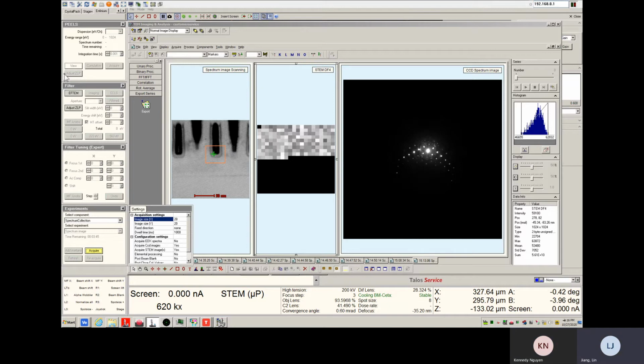All right. And then if you want to stop, you can just click acquire again. It's going to stop. Okay, stop.